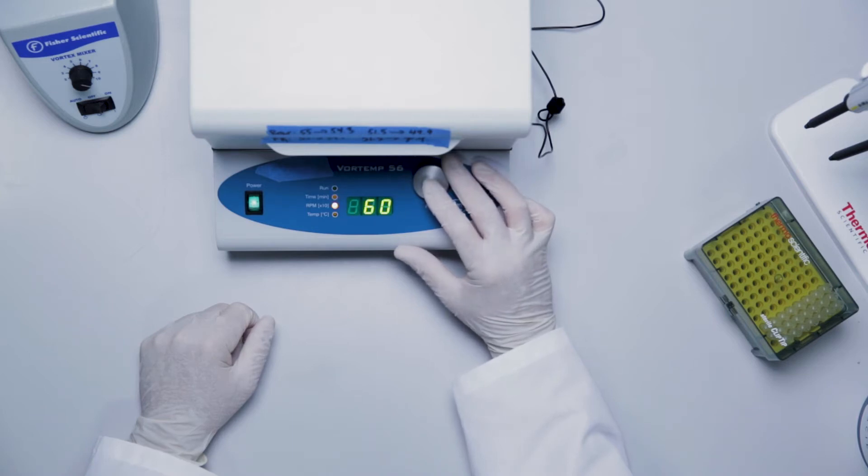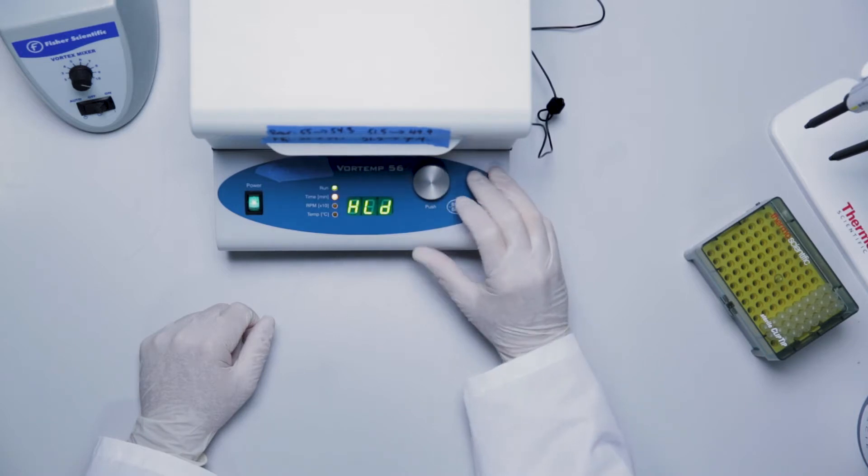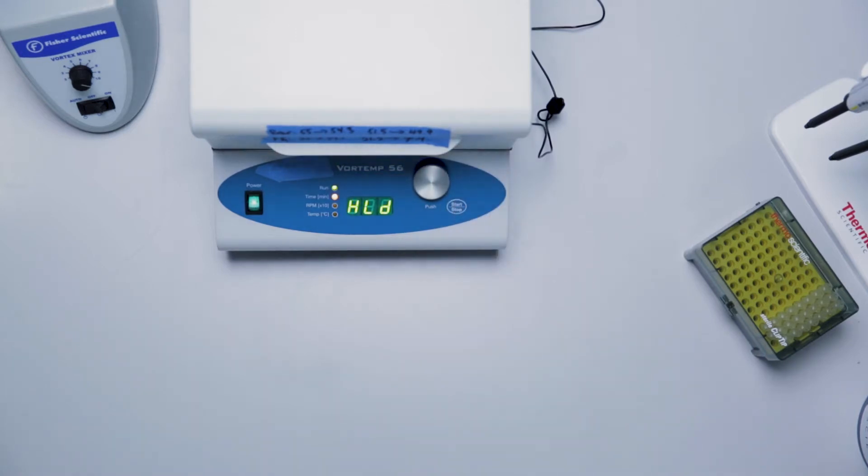Set and start the incubator to 54 degrees Celsius, plus or minus 1 degree Celsius. The Vortemp should be set at 600 rpm while the Max-Q should be set at 300 rpm.